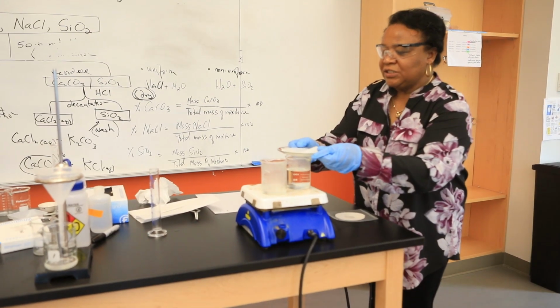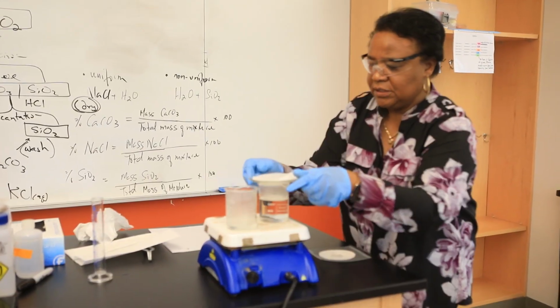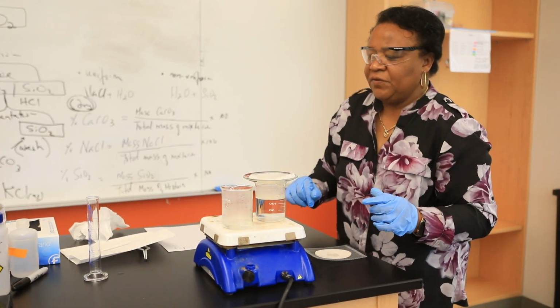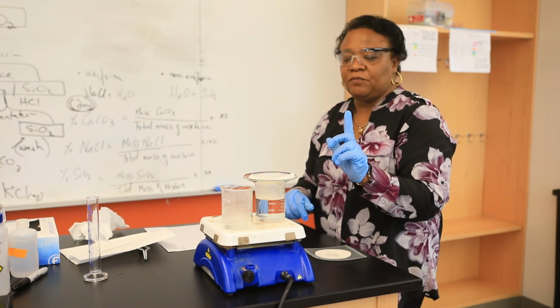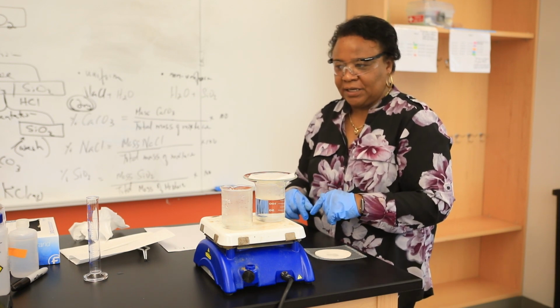Alright, so this was just like with our sand. We're going to allow the filter paper to dry. And then at the end, I will report out the mass of the filter paper, the watch glass, and the calcium carbonate.